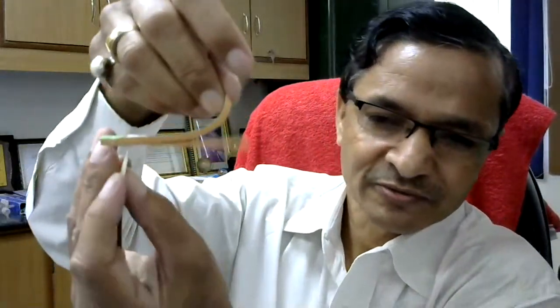Now you can see this, and you can see the stack of papers. You have to remove one strip, tear it, and dip it into the solution.